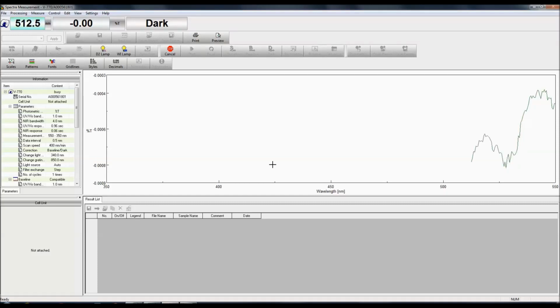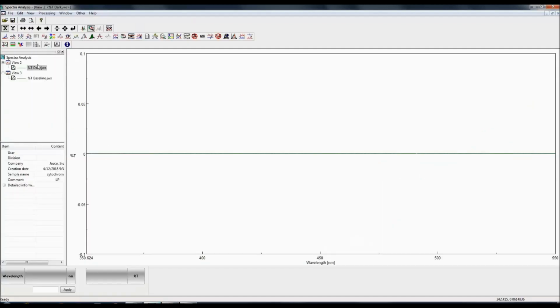To verify that the dark correction was done properly and is at 0% transmittance, after the correction is performed, click the sample measurement icon. The corrected sample spectrum, which should be of the empty sample compartment, will show a 0% transmittance since no light is getting to the detector.